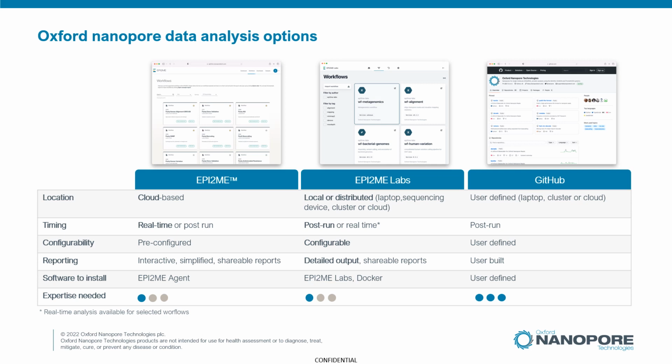So GitHub tools sit in our nanopore repository and provide the latest pipelines, base callers, modified base detection tools, and many other research resources. These may require bioinformatics expertise for implementation in user-defined workflows.